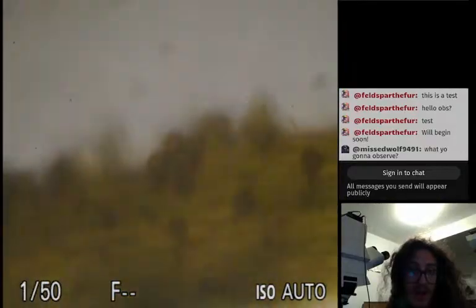Right here. Kind of has a neat little pattern to it. Just like a normal stem. And then towards the tip, here's some. We've got pollen. Those little blobs, right there, right there. Those are pollen, and they are what makes me want to die. But I think this is really interesting because it shows how the pollen is formed inside the guy, and then inside the dandelion. And then it's kind of pushed out. That's kind of cool.